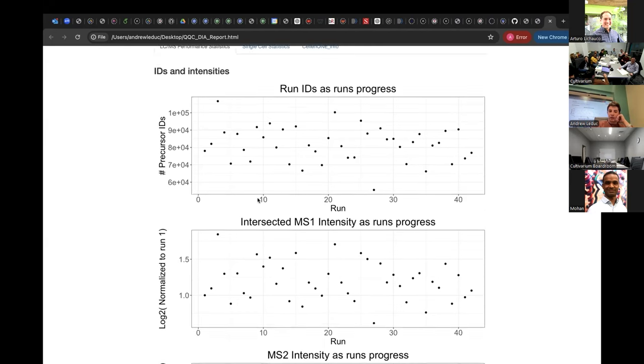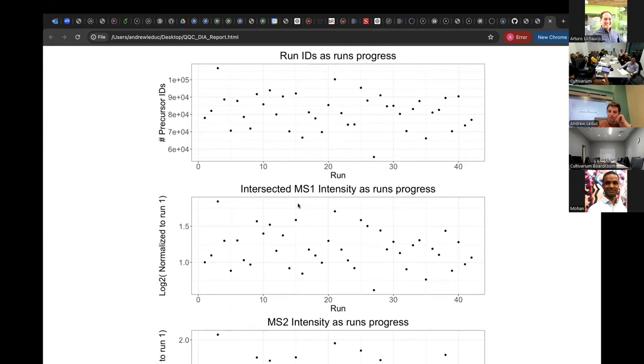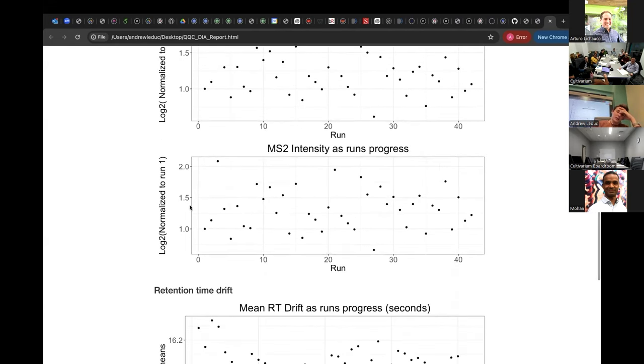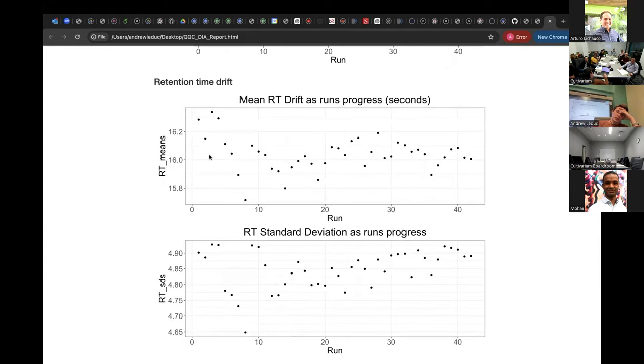that there's a dip. And so you also can look at that by MS1 intensities, you know, identification is not the only relevant metric, and MS2 fragment intensities. You can also look at the retention time drift. This is just taking the average retention time for intersecting peptides. You can see there's a bit of run-to-run variation, but it's not too bad. And also the deviation, this is the standard deviation in the retention time distribution across your samples.